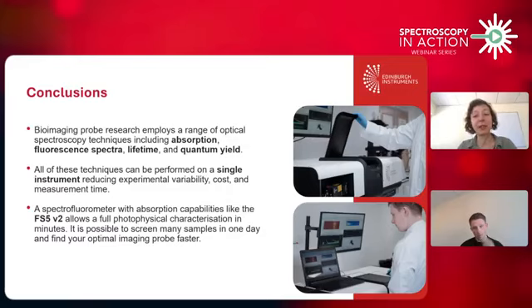And I just wanted to highlight that performing all these techniques on a single instrument is going to offer many advantages. I hope I've been able to show you can screen many samples in a short period of time, and this is going to accelerate the development of new fluorescent probes.